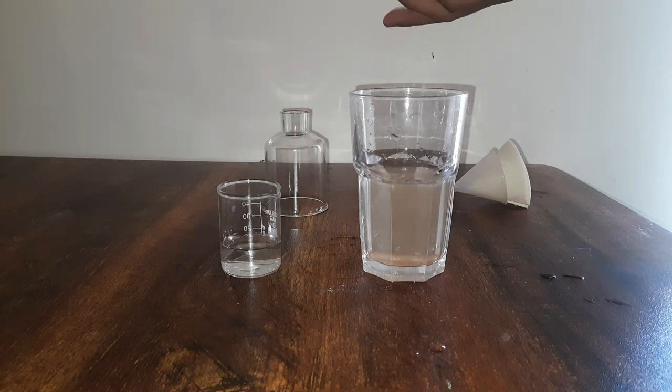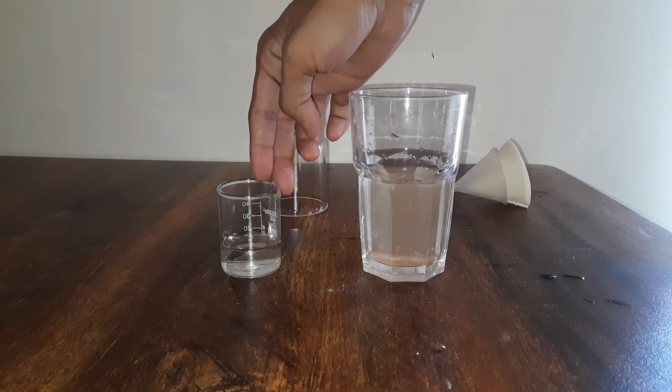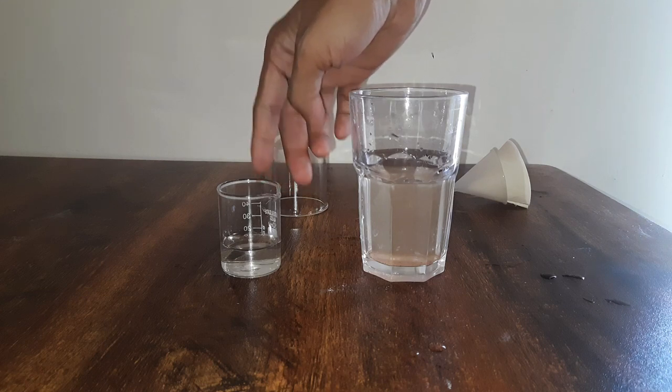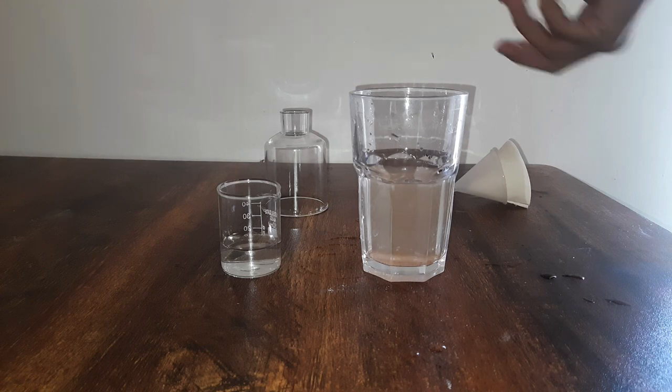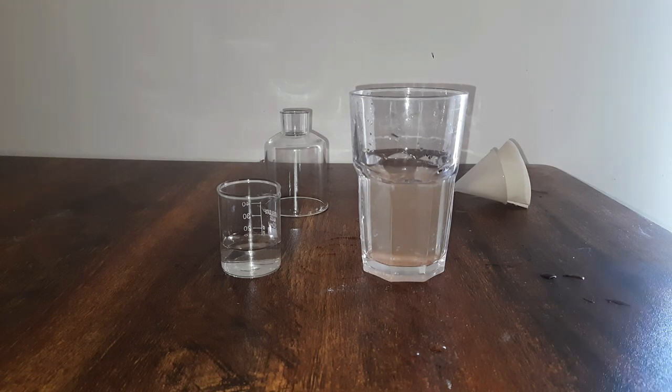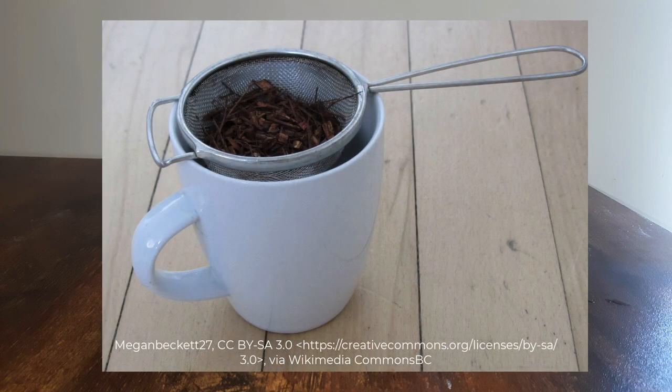And to further separate the small sand particles from the mixture, we can pour this mixture again into a new filter paper and wait for some collection in the beaker. So this method is called filtration. In fact, you might have carried out this activity in your normal daily life — that is when you filter tea leaves. That's also a type of filtration.